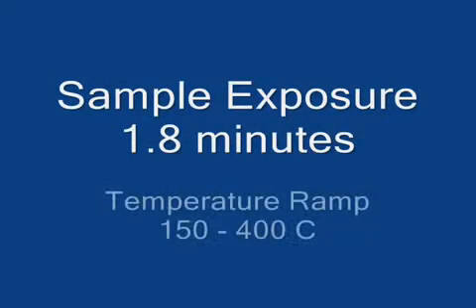The time scale of this experiment is accelerated here. In reality, each exposure is about 2 minutes.